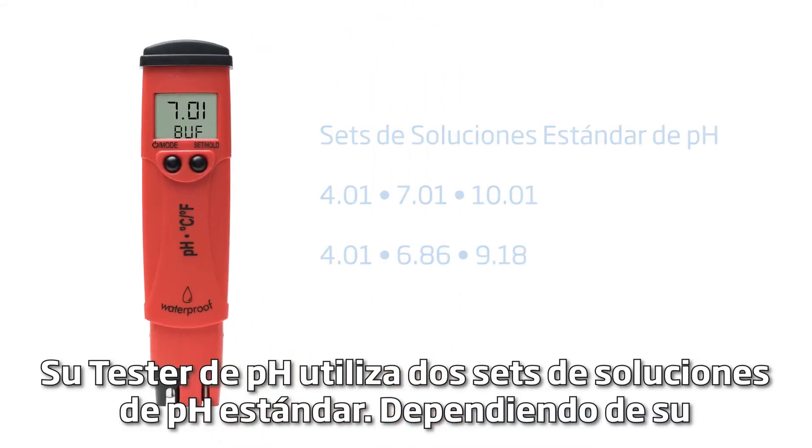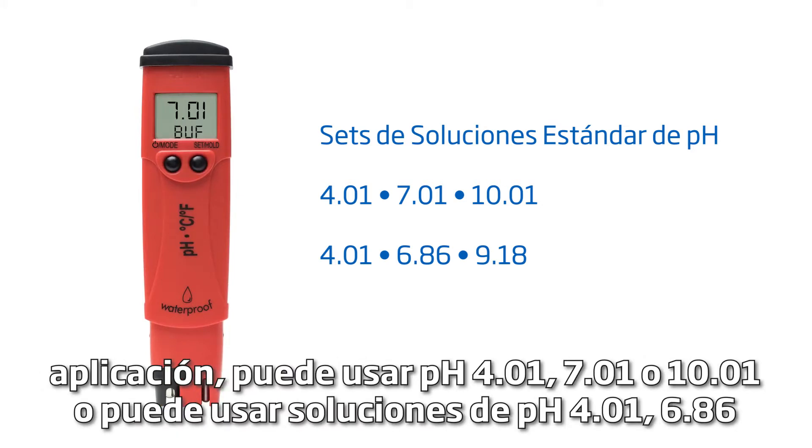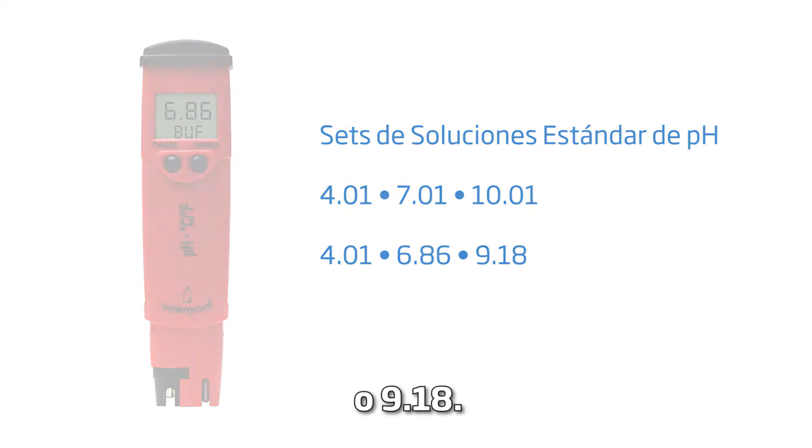Your pH tester uses two sets of standard pH buffers. Depending on your application, you may use pH 4.01, 7.01, or 10.01, or you can use pH 4.01, 6.86, or 9.18 buffers.